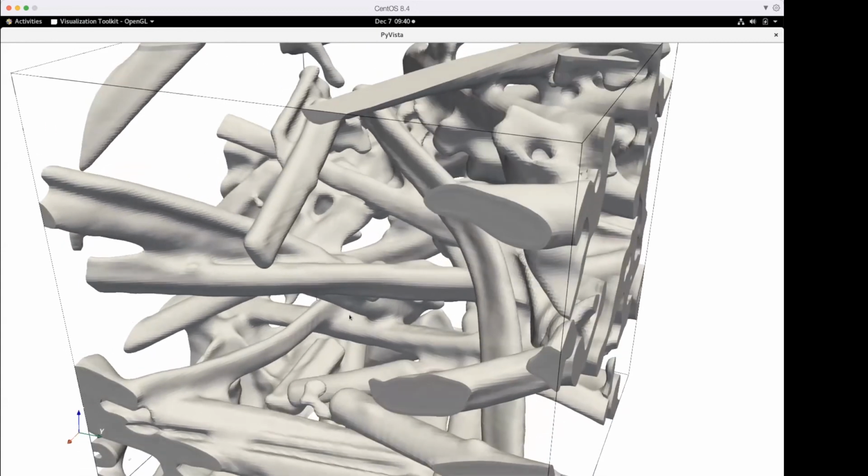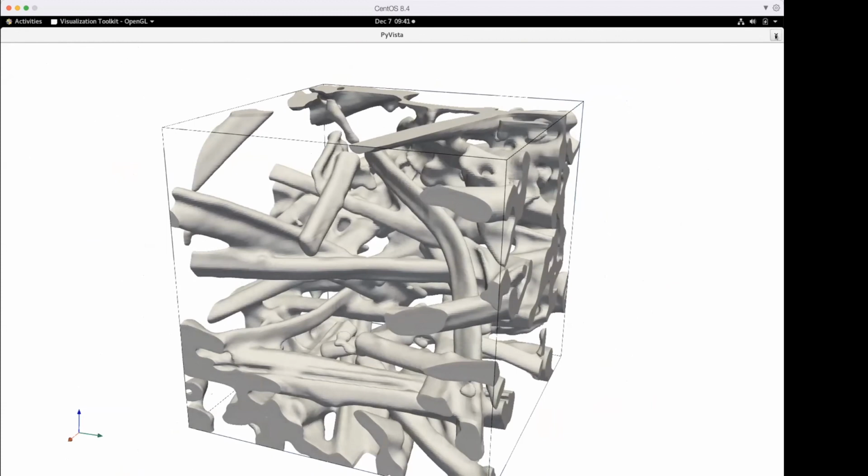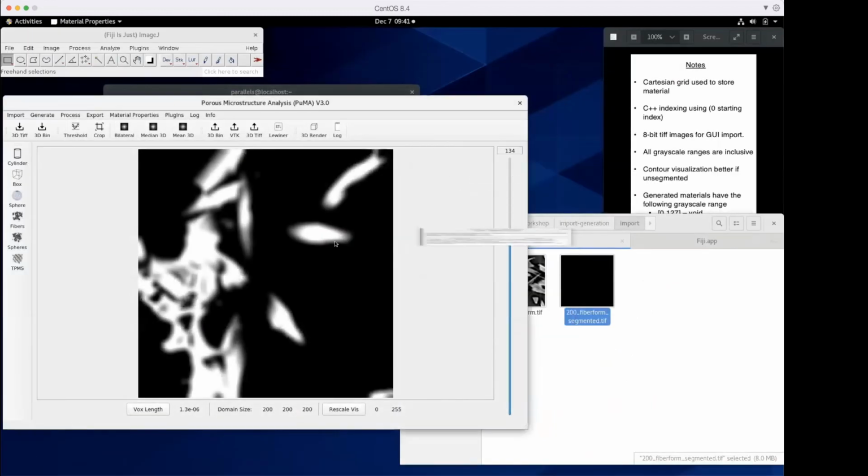Yeah, Ali, one thing that is important also to mention here. Of course, Joseph is focusing here on the visualization, right? But eventually the question comes to how important is this for computing effective material properties? And the answer is it depends. There are some properties where this might be important, if it's based on the surface.